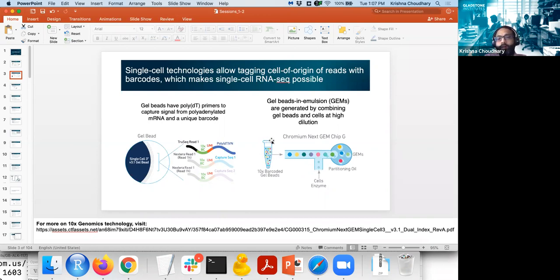And also there are some beads which have DNA oligonucleotides sticking out from them, and these beads have barcodes and unique molecule identifiers, along with priming sequences and adapters, which will be added onto the mRNA sequence that will be captured in the cDNA form upon reverse transcription.